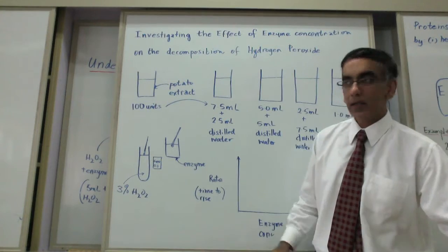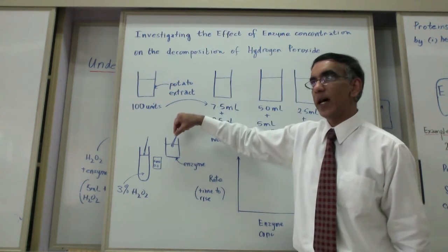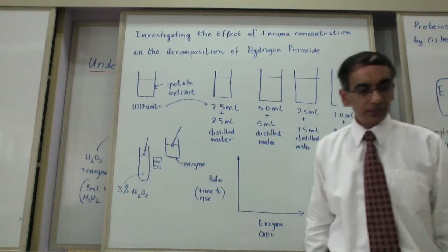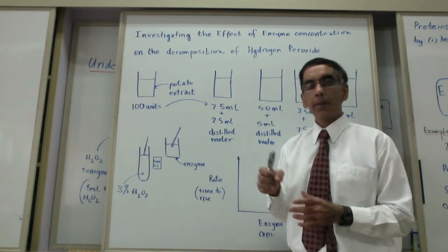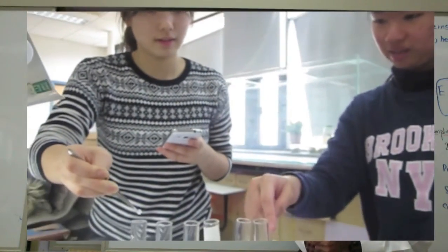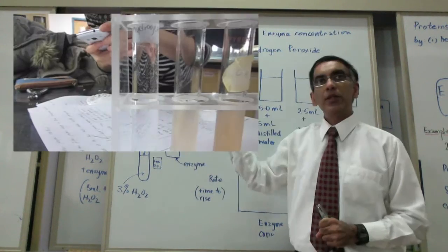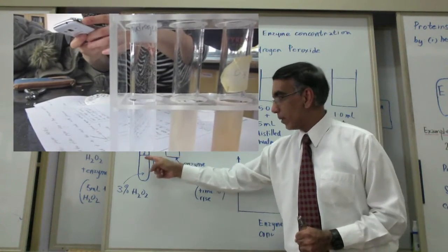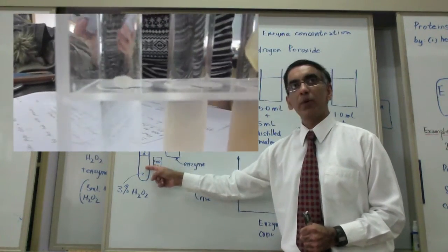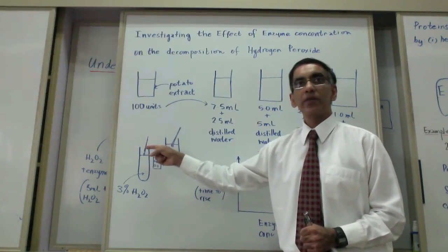Today we're just taking the 3% peroxide and we're taking the forceps that you have there, and then we're taking the hole puncher that you have there, punching out some holes from the filter paper to make some filter paper discs, holding it with the forceps, and then as soon as the disc goes right below the level of the peroxide, you start a stopwatch. This probably will sink. Even if it does not sink, it's going to go down to its lowest point, and then you stop the timer when the disc returns to the surface.